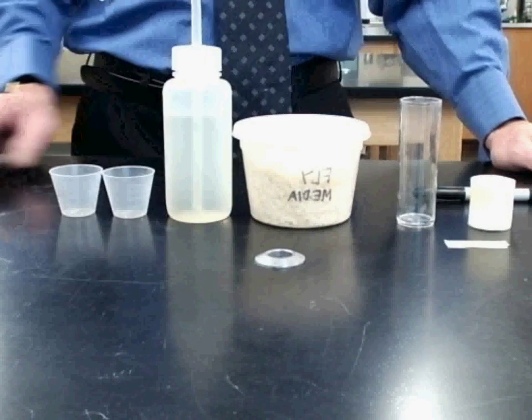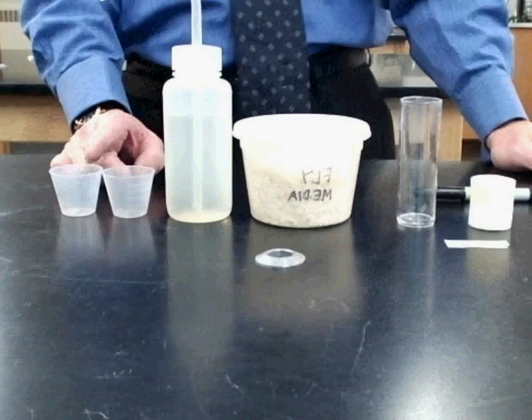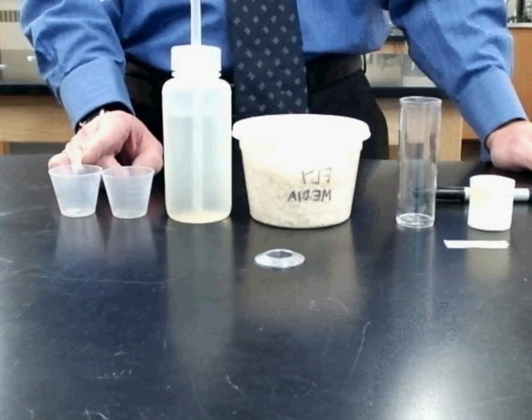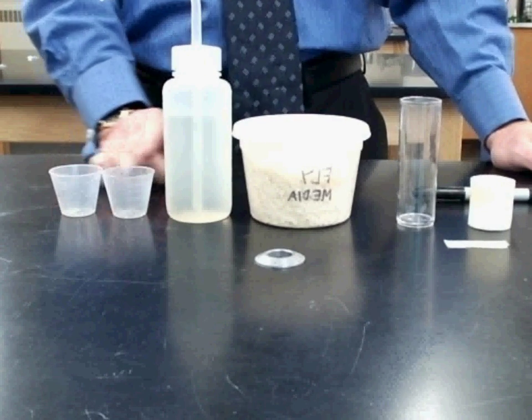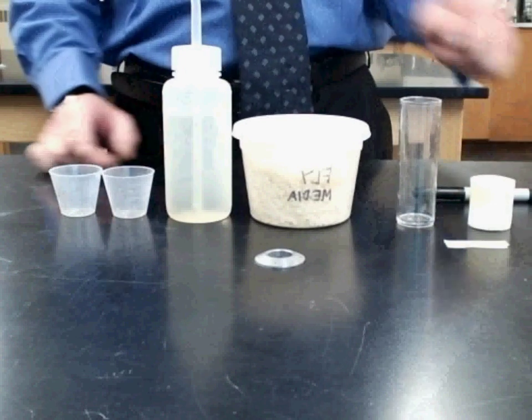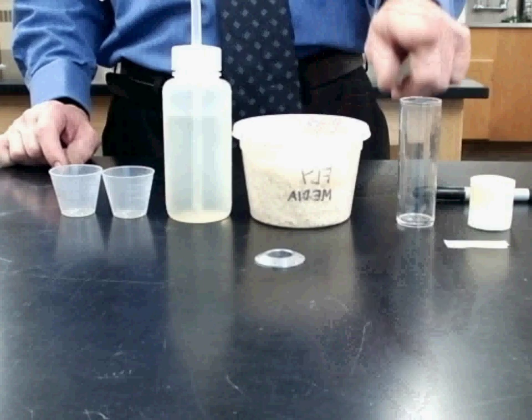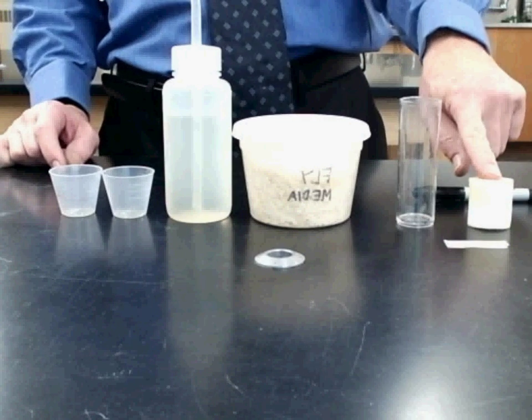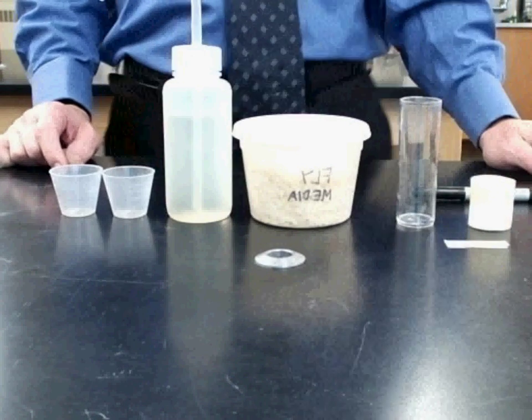What you need are two measuring cups, basically medicine cups. You need water - it could be sitting tap or regular tap. You need your fly media, your fly vial, your sponge top, and a label tape and marker.